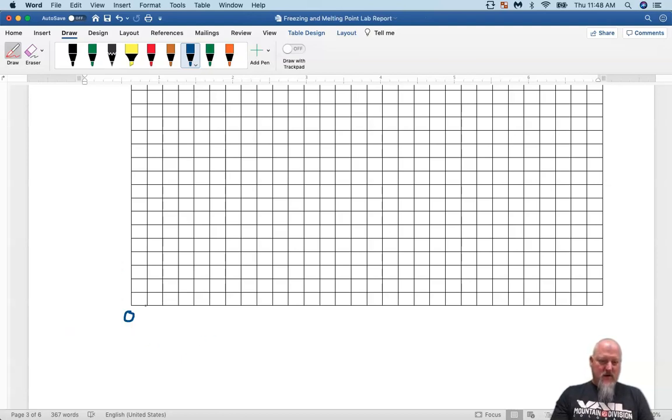Okay, so 0, 30 seconds, 1 minute, 1 and a half, 2 minutes. So if I put that, let's do every 3. So that's 2, 2.5, 3. So right there's 3 minutes. I'm going to write 3:00, and I might mark that like right here. Boom, that's the 3 minute. And then I'd go over 3.5, 4, 4.5, 5, 5.5, 6. So right here it's going to be 6 minutes. So I'm going to write 6:00.